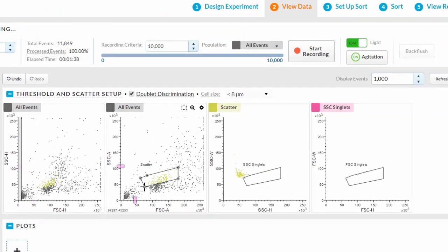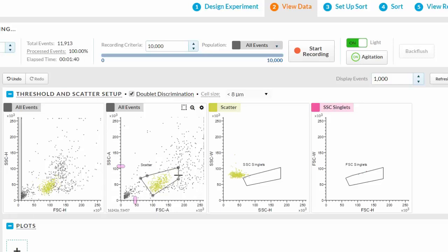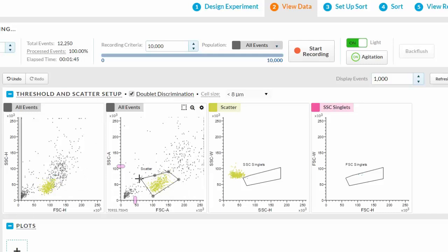Gates can be easily modified, enlarged, and moved. In this example, let's make the gate encompass just the singlet events.